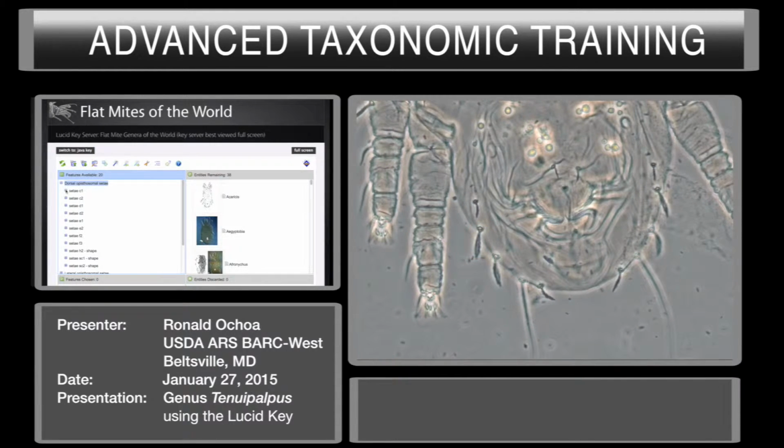If you see the larva of this mite, you will see that the position of the F2 is not in the border, it's more in. The reason that it's right now in the border is because of the artifact when we squish the mite. Now, knowing all that, we return to the key and we select what we just saw.